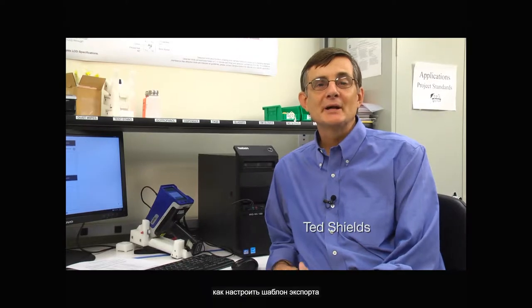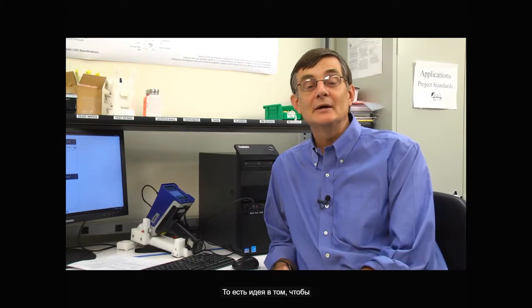I'm the product manager for the Vanta analyzer, and we're going to show you today how to set up an export template that controls the way your export looks, so that your export can look just the way that your report does, so that you can just cut and paste from the export into your report, lessening the time that you have to spend editing files. So this is all driven by the idea of a profile that is edited in the PC software.